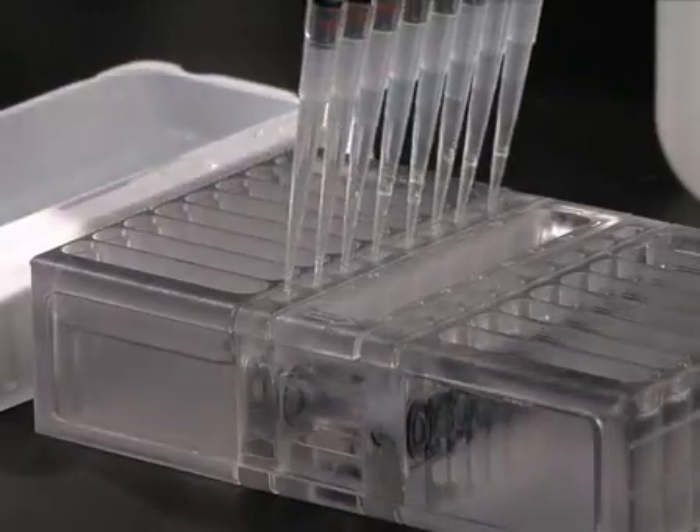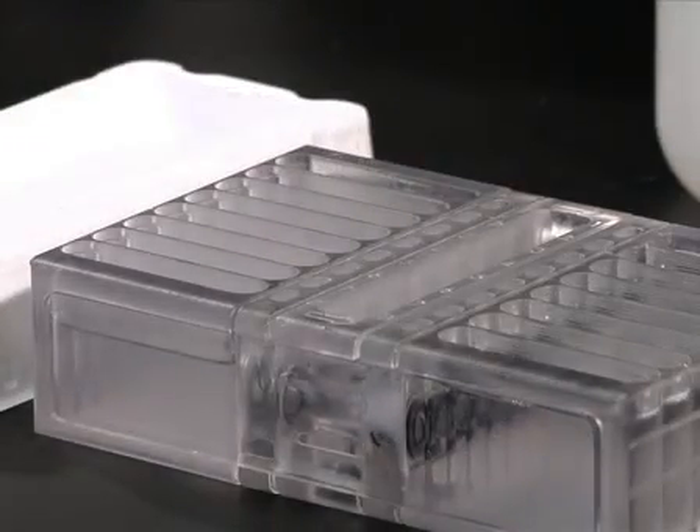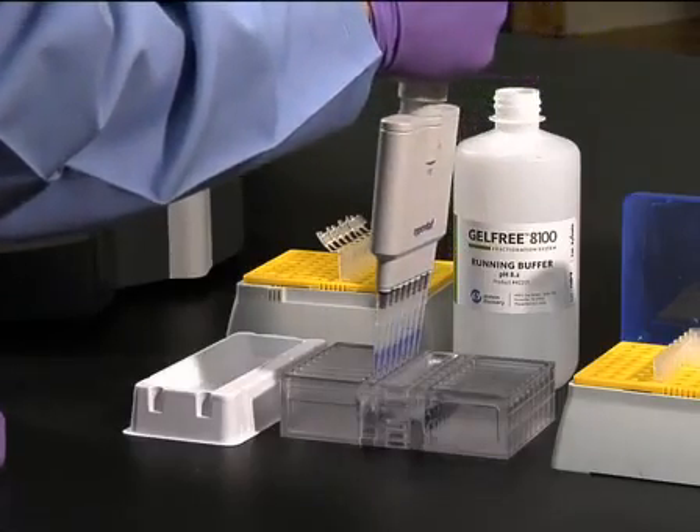Using an 8-channel 100 to 200 microliter pipetter, remove and discard any buffer that flowed from the cathode buffer reservoir into the sample loading chamber, and immediately load the samples into the loading chambers.